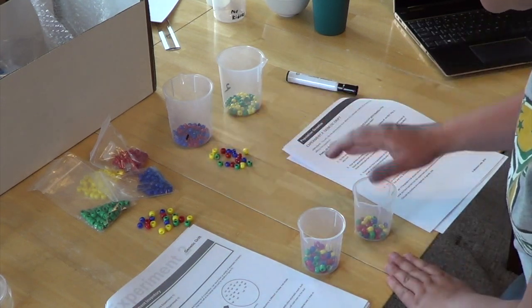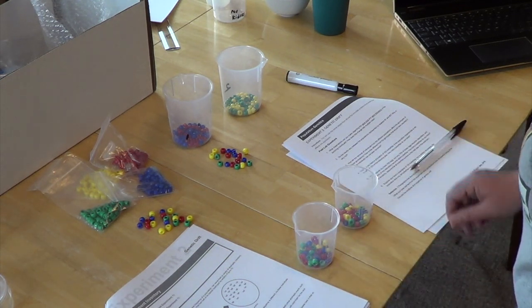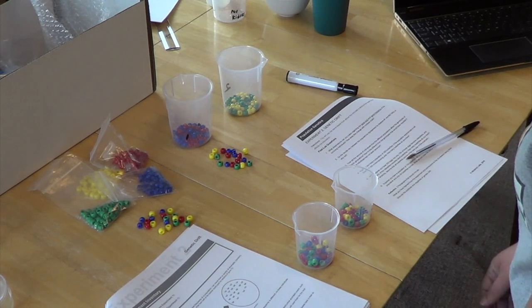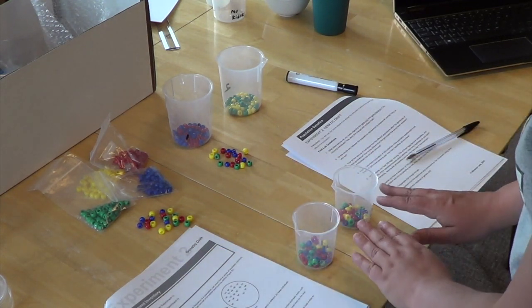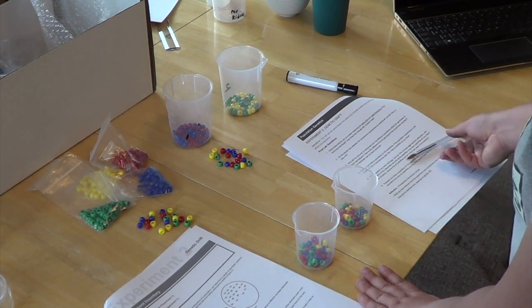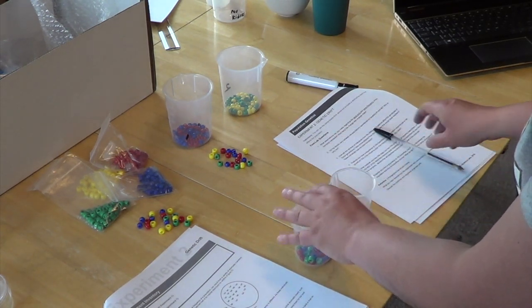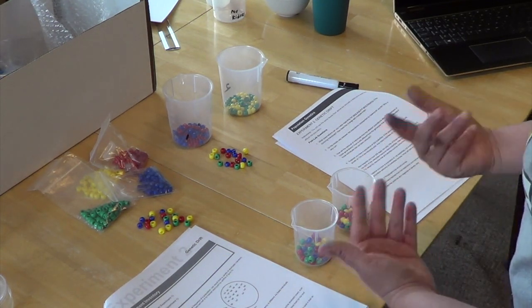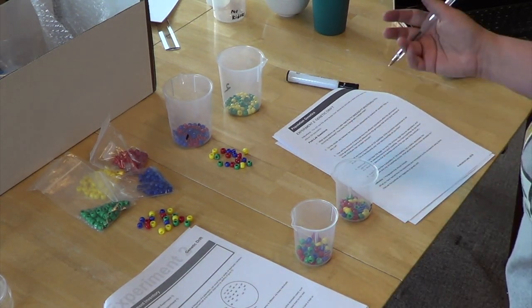Set it aside. And so now we're going to answer our post-lab questions. What will happen is you're going to repeat this 4 more times. A lot of people like to make a table of this when they do this. That's totally fine. So for instance, this would be considered round 1. In round 1, you would say, okay, beaker 1 has however many reds, however many blues, however many yellows, however many greens. And then beaker 2 has X number of yellow, red, blue, green.